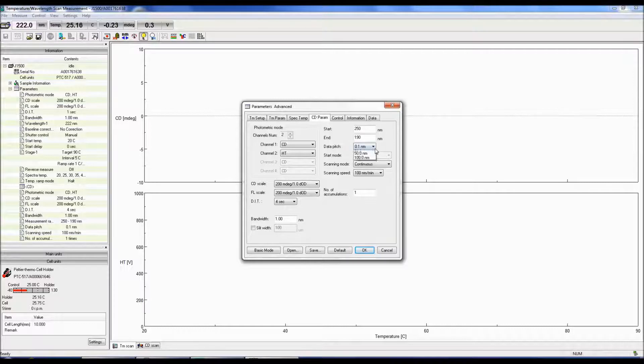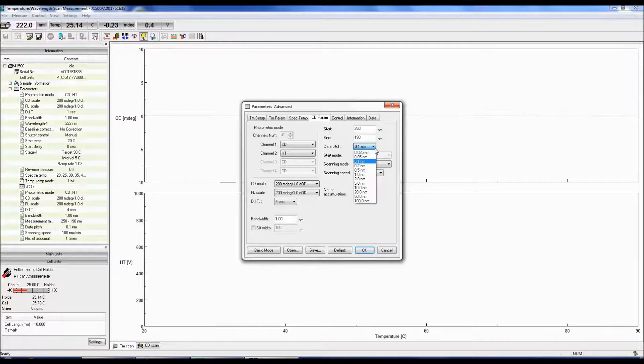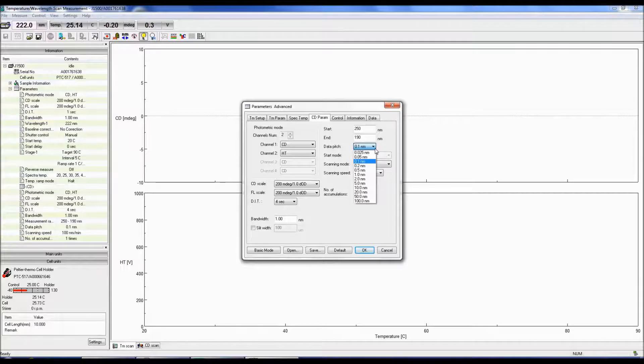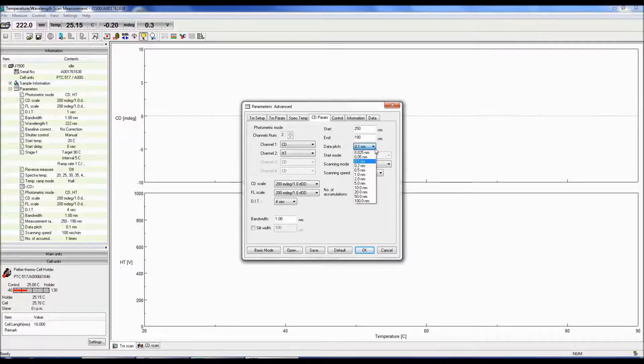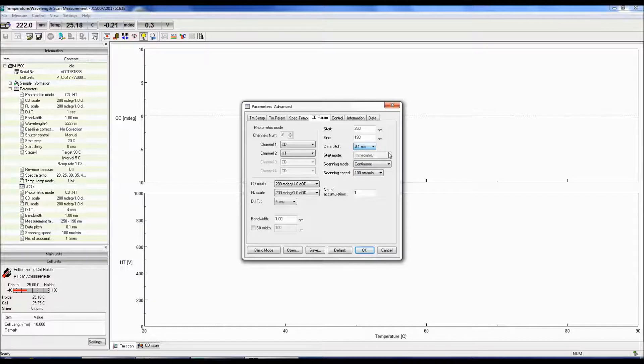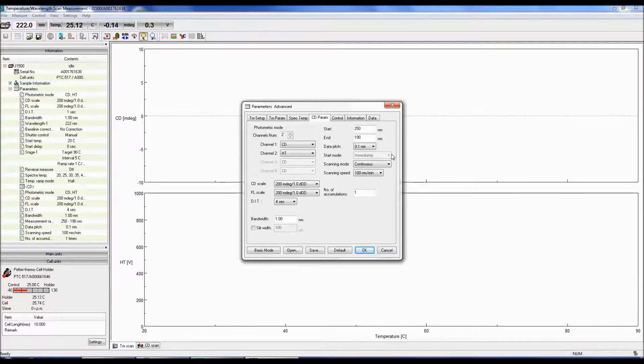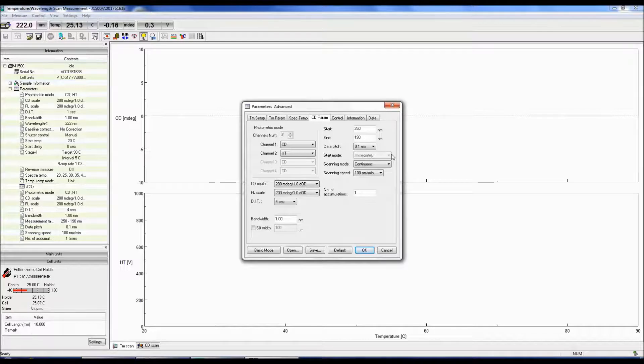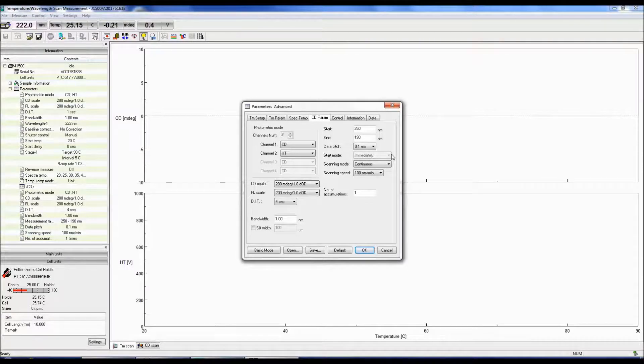The data pitch determines the number of data points collected at the specified interval. 0.1 nm is a good interval to start with and should provide a spectrum with an optimal signal-to-noise ratio. Selecting too small of a data pitch and you might obtain a spectrum with a lot of noise, but too large of a data pitch and crucial data points could be missed.